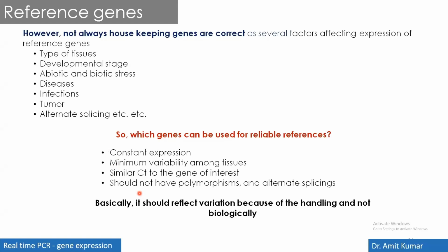Nowadays, what is happening is that for each experimental setup, you have to define your own reference gene based on the condition you are studying. For example, if you are studying a non-model organism, and if you are treating your organism with unconventional stress sources, for example a decrease in pH or an increase in carbon dioxide, or any such conditions which are not previously studied in much detail, you may have to use at least 8 or 10 different genes. Again, common housekeeping genes, as well as some of the genes which you think should not be expressed much in your experimental condition. You have to take all those, design primers, do the real-time PCR in triplicate, and then find out which can be a good reference gene for your case.